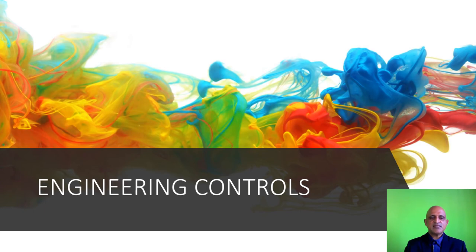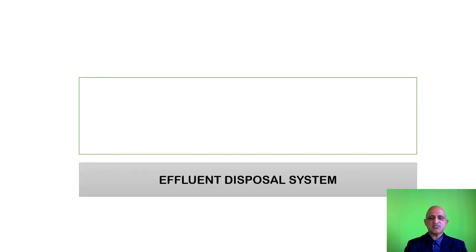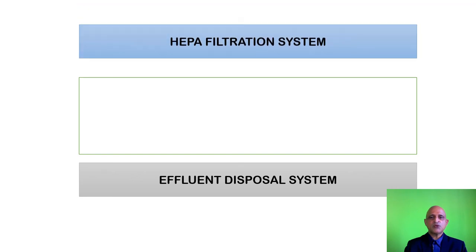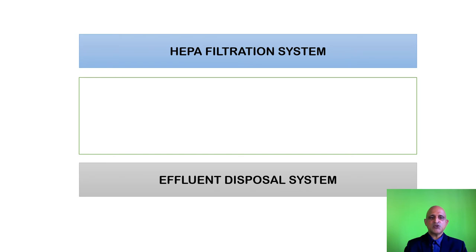The third control is the engineering control. To understand engineering controls, you need a basic understanding of your laboratory layout. Consider a conceptual laboratory as an enclosed space. If management decides to upgrade this to a BSL-2 or BSL-3 laboratory, the first thing to address is the effluent disposal system, responsible for disposing of all waste and liquids from the facility. You then add a HEPA air filtration system, which requires designing two additional floors to house both the HEPA filtration system and the effluent disposal system.